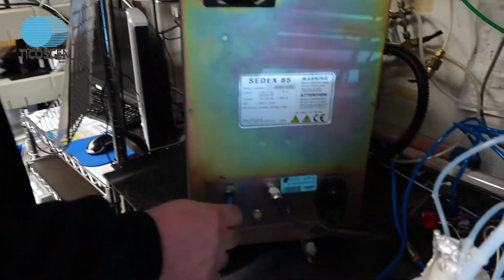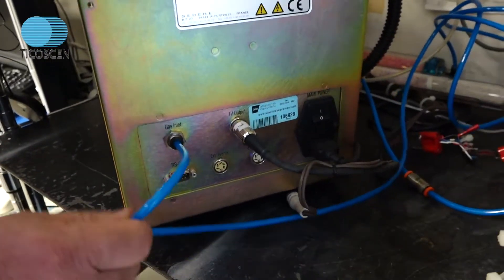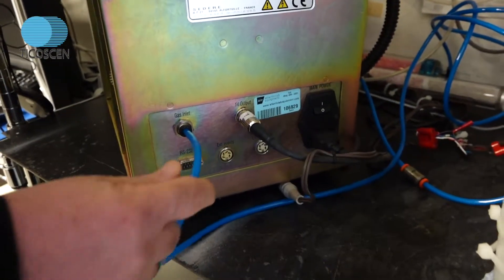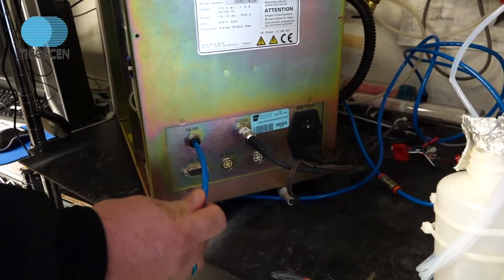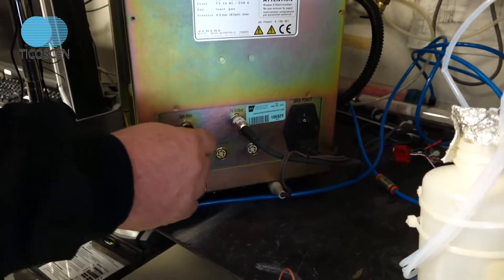There are a few things on the back of the ELSD you need to pay attention to before you start using it. On the back here, we have a nitrogen supply. And it's also critical to know that this blue tube is six millimeters in diameter. It is not a quarter inch. Do not stick a quarter inch tube into this hole. This is six millimeter. It's metric.